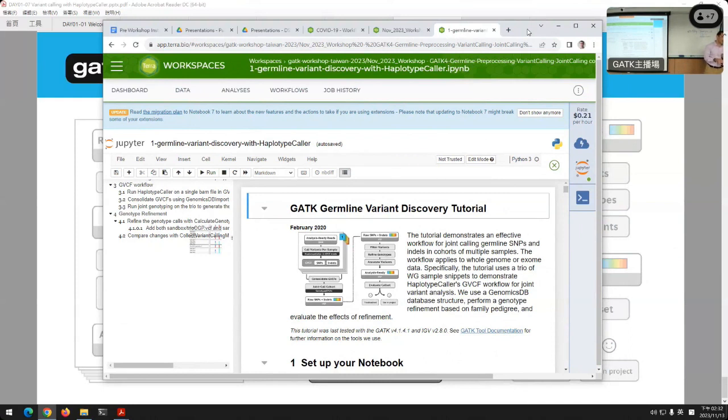You can see the original and the new haplotypes, and the reads aligned to the other haplotypes if you want. It's not on by default because it's a lot. The input and output is the thing killing you here. You're reading in all the reads and writing out all the reads again. And so most people don't want to spend the compute for that, but you can see it for sure. Great question. Did I answer your question? Yes. Yeah. Thank you very much.